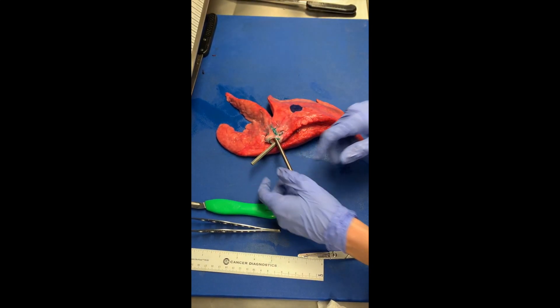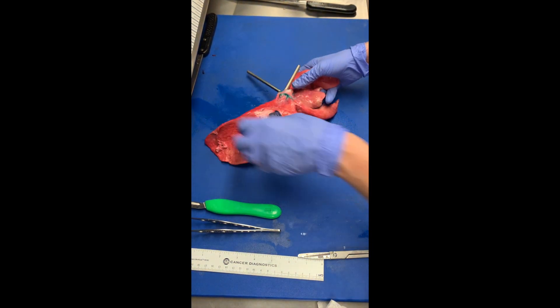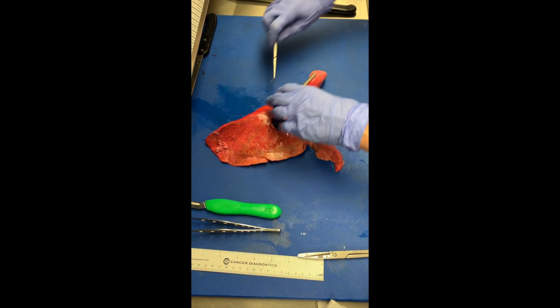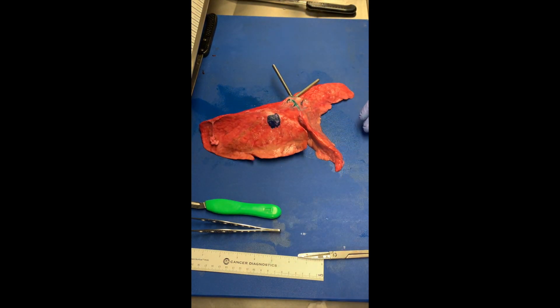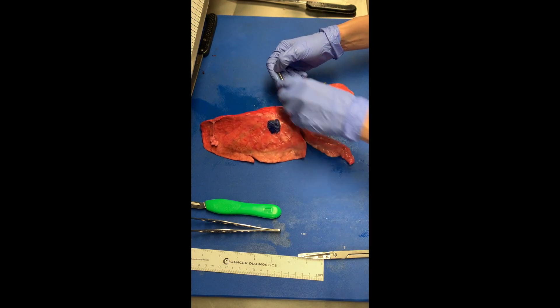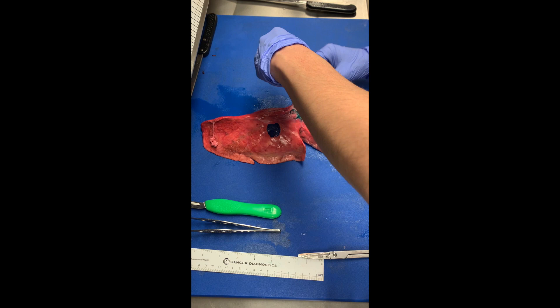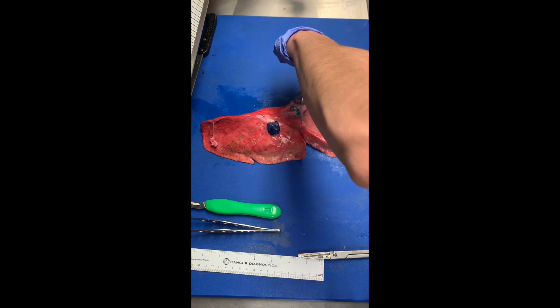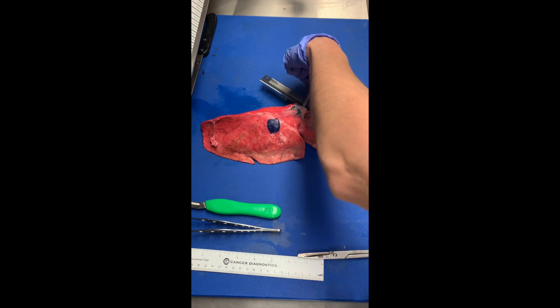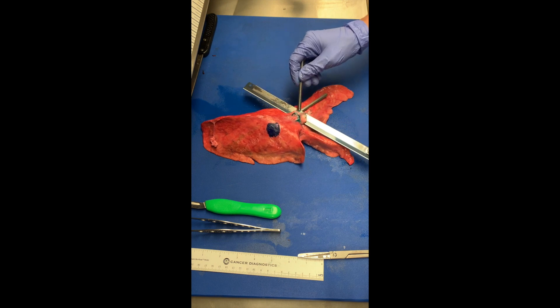Go ahead and place your probes in the airway. The next thing you're going to do is take your long blade and place it between the two probes, and you can use the probes themselves to help guide this cut. Make sure you're being very aware of where your hands are, and you can start cutting along with the probe.